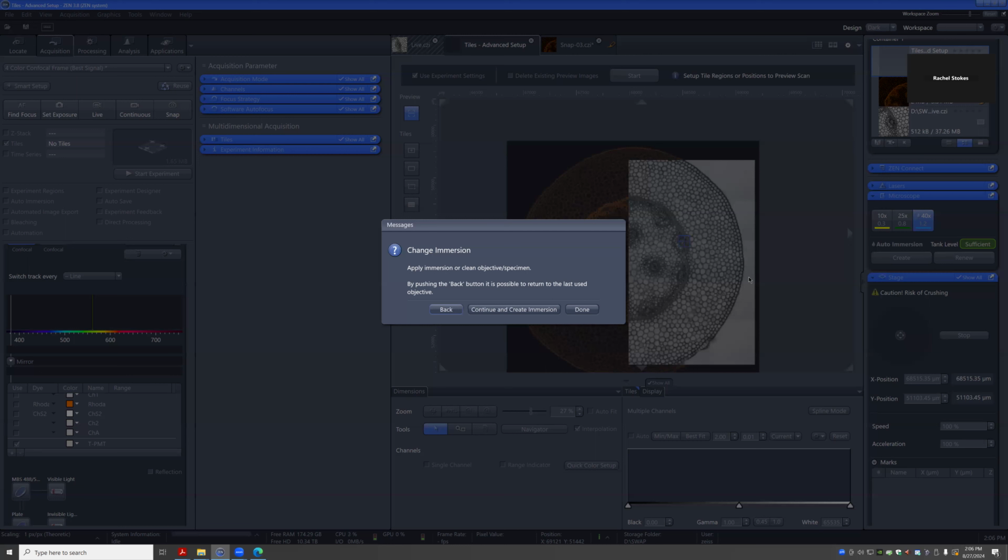So do it when the system's off. It doesn't have to be off. Oh, okay. So you can do that now. Yeah, exactly. Because this is not directly hooked up to anything apart from the pump that is on there. I mean, you don't want to use any of these buttons while you're pulling this out. And you don't even have to take the whole thing out. You could pull it out only partially and then add it and then move it right back, or pull the whole thing out.